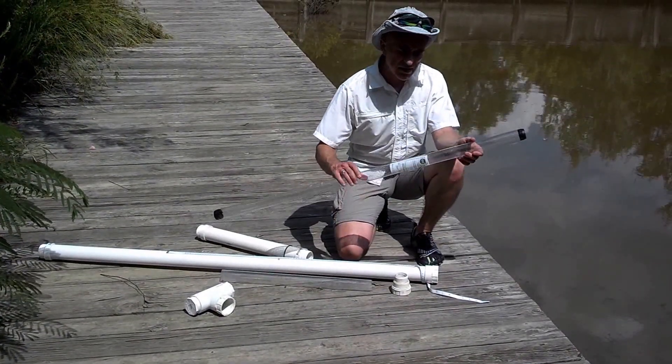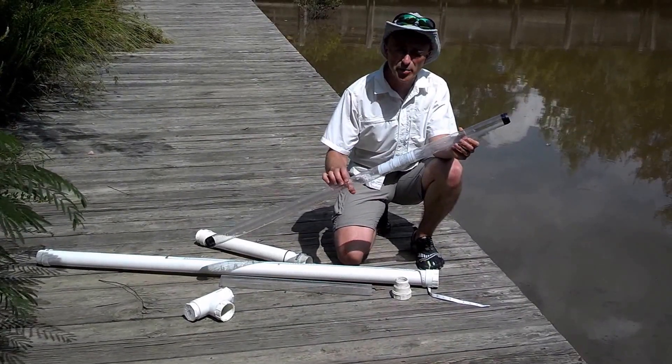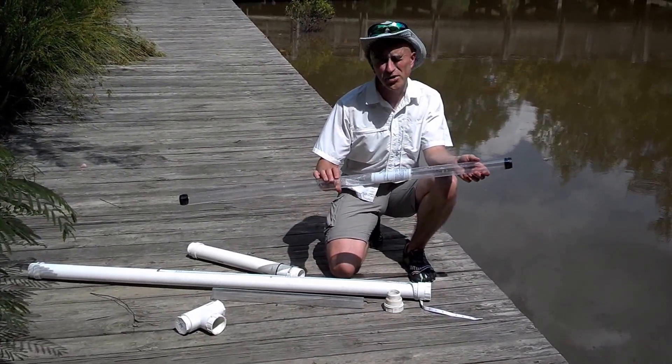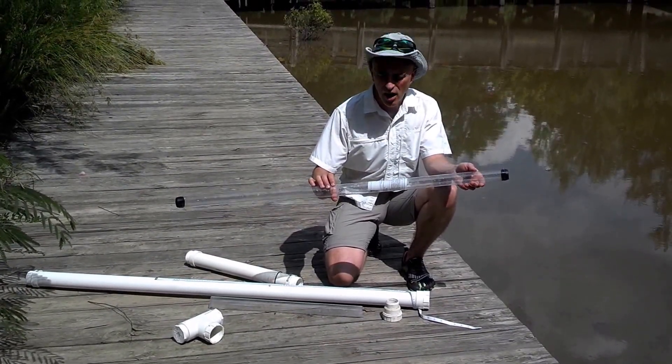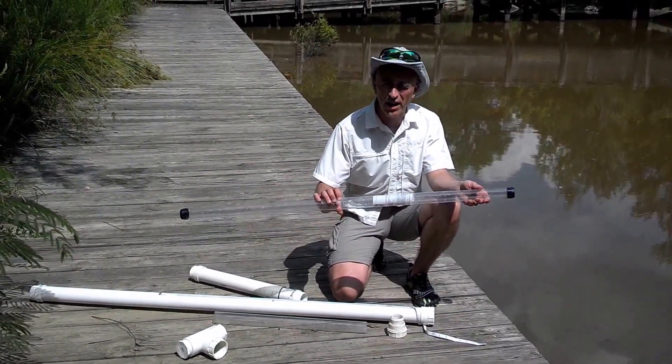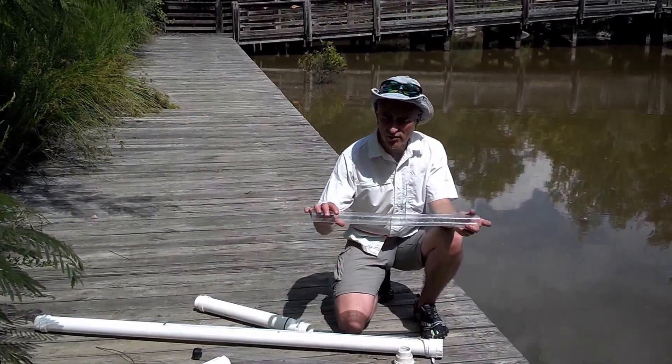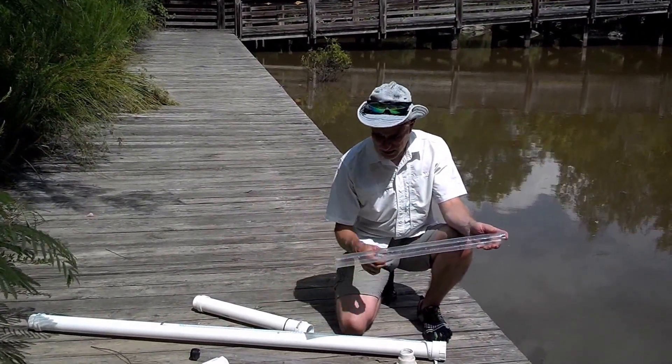This coring device is built around the T12 polycarbonate light protector you can get at any hardware store. This is designed to protect fluorescent lights in a working environment so that glass doesn't shatter. In this case it will be our core liner, and I've cut this in half — it's approximately two feet long.